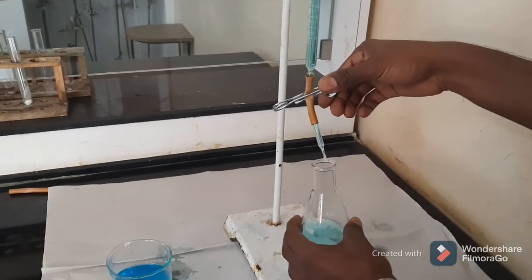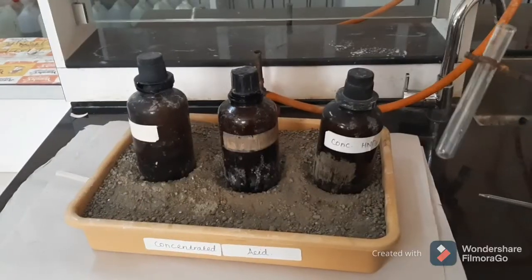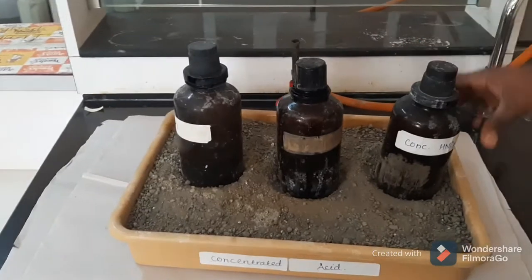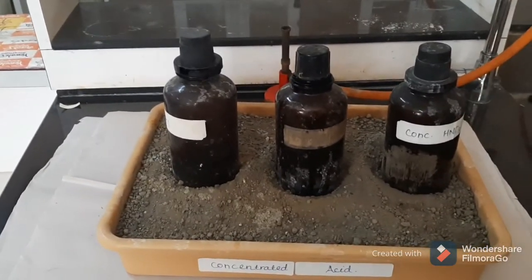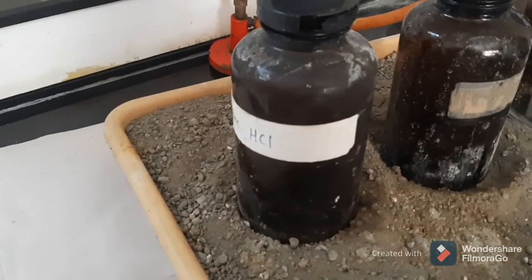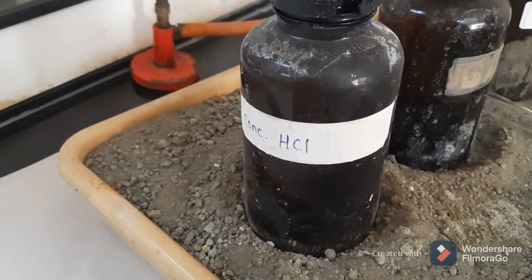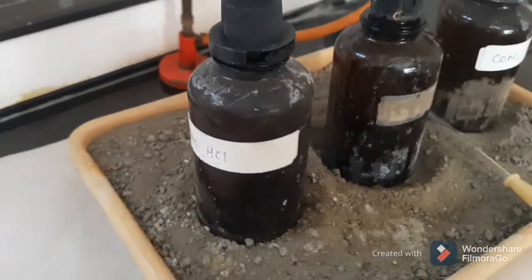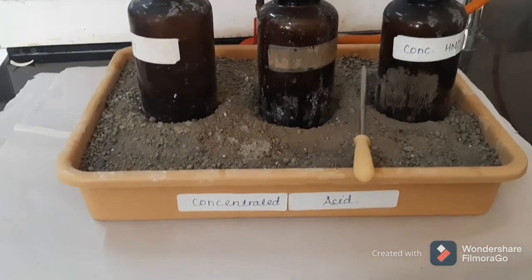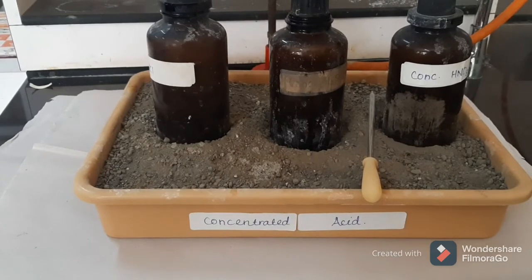Now we will see the handling of concentrated acid containers. These are the concentrated acids, which we always keep in glass bottles placed in a vessel or tray containing dry sand. These acids are extremely corrosive to all body tissues and very dangerous for eyes and skin.